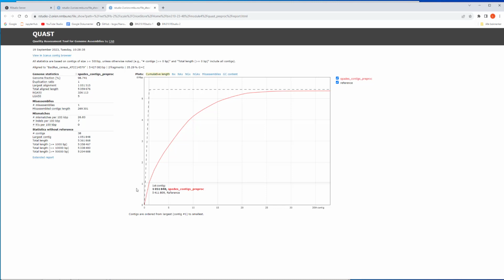The reads, especially Illumina reads, are pretty good, right? And the bottleneck of the assembly is how much repeated regions you have, and that is not something you're going to fix by the pre-processing anyway. So more or less the same, I would say.